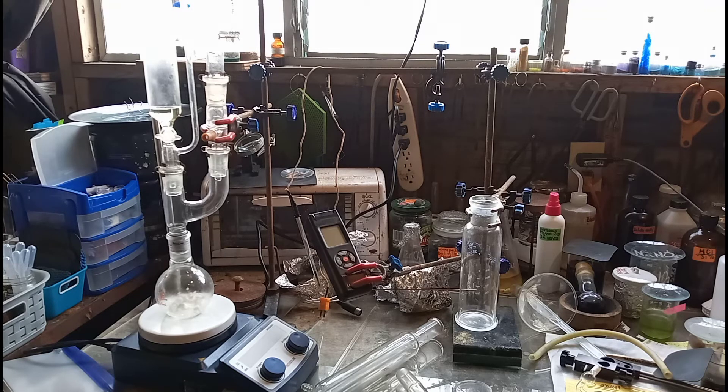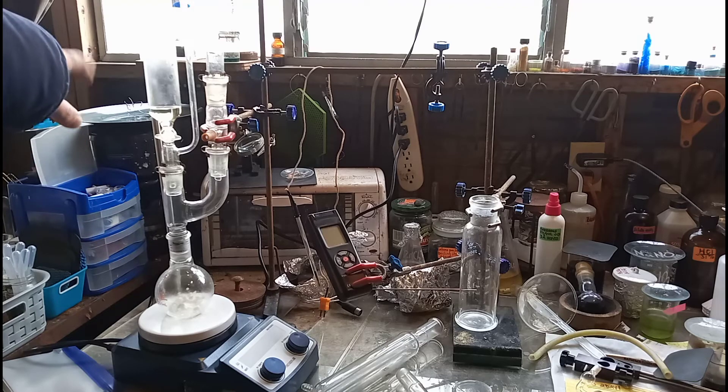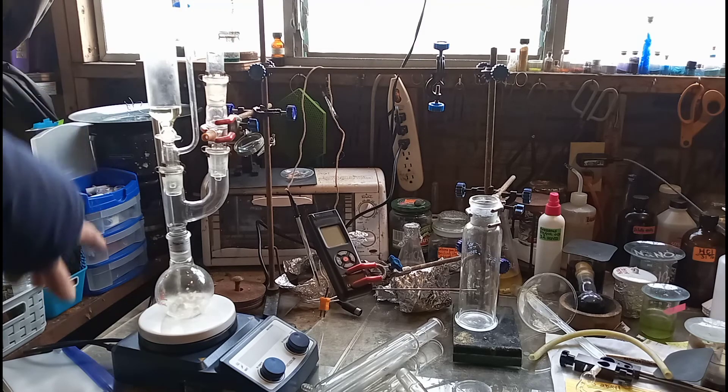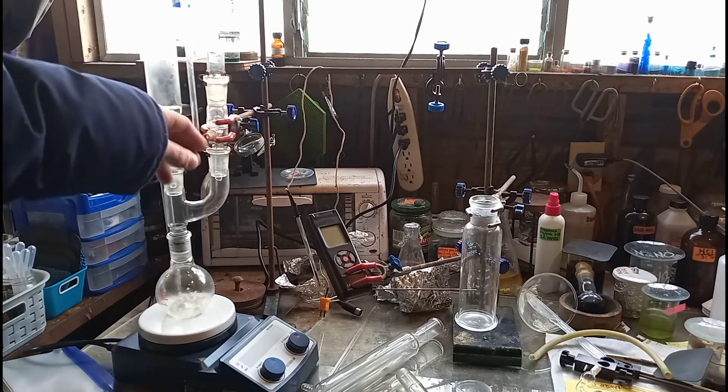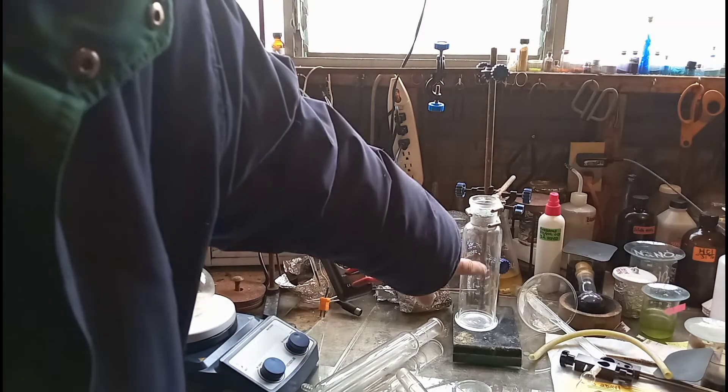Right now what I've got going on here, this is what the setup looks like. I'm not measuring out anything — I am just whipping this together quick for a demo for you guys. What you're looking at here is just your standard TCCA/HCl chlorine gas generator setup. I've got it going through a Claisen adapter to a gas output that is going to go into this wash bottle here.